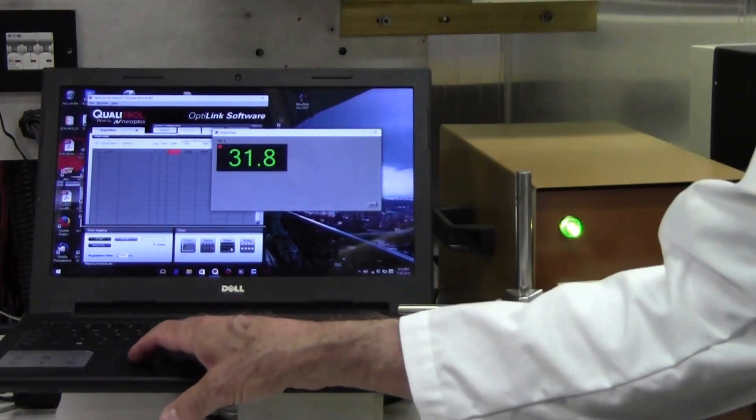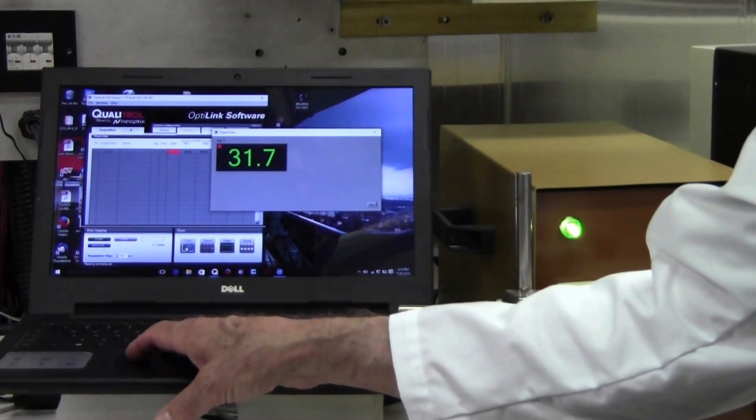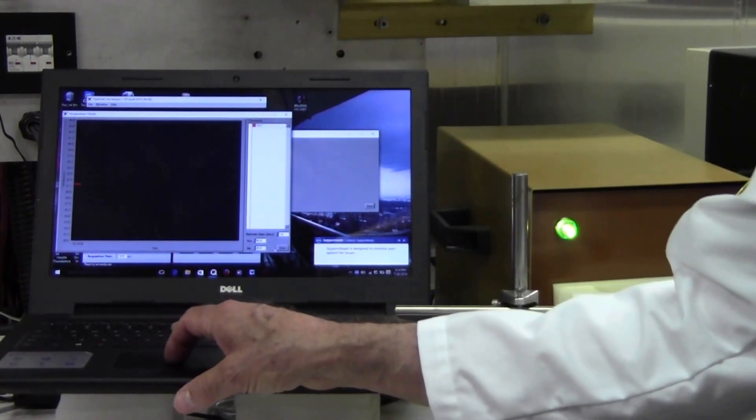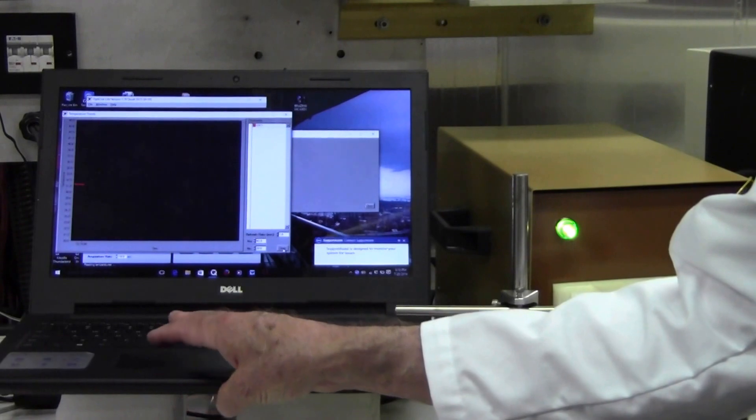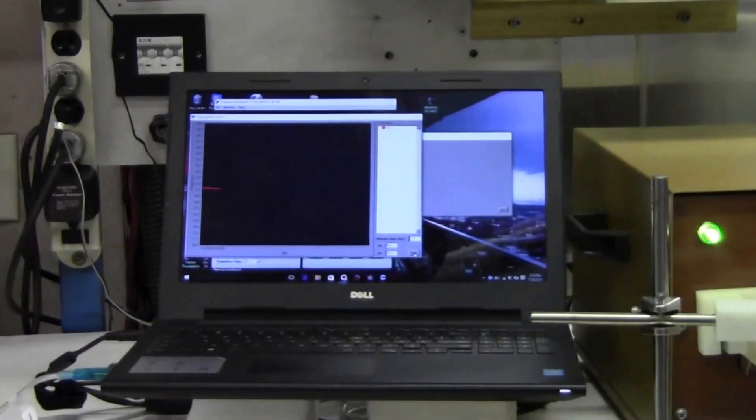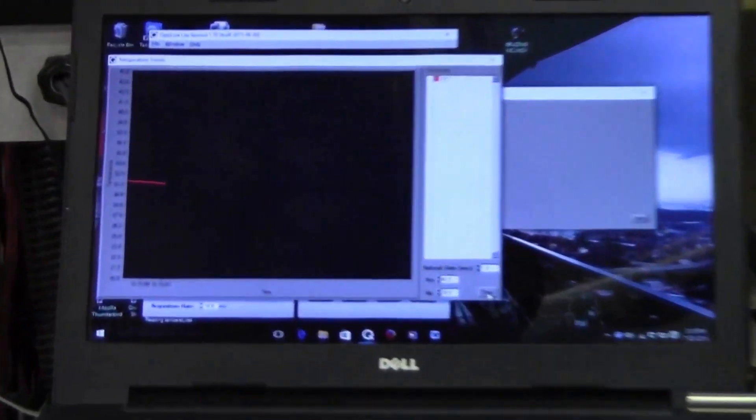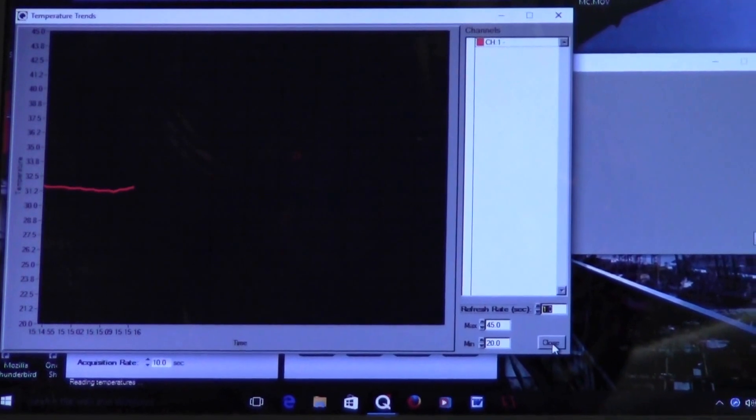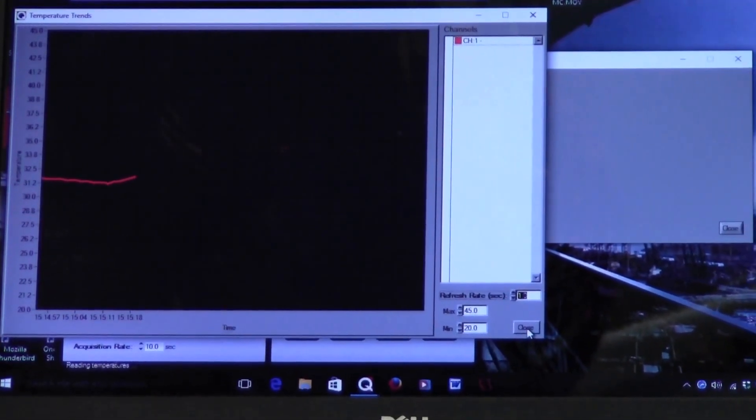And I'm going to turn on the bar graph. And you'll see we're already at that position. So now we're heating. We'll see the bar graphs you can zoom in on. Okay, the bar graph is climbing.